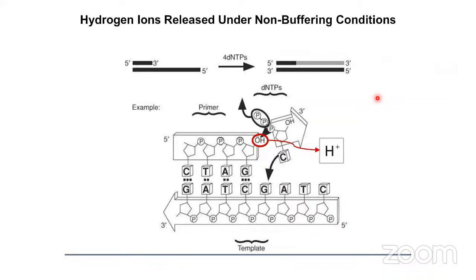Talking about the principle of how this Ion Torrent S5 works, it works on identifying the proton ion which is released during the formation of a phosphodiester bond. We have all learned in molecular biology that whenever one nucleotide is added to the ongoing strand of DNA, there is formation of a phosphodiester bond, which is something like this, and there is a release of a proton ion.